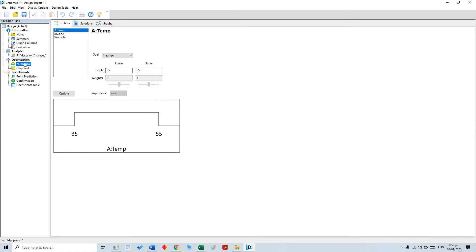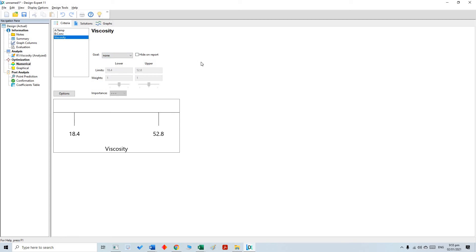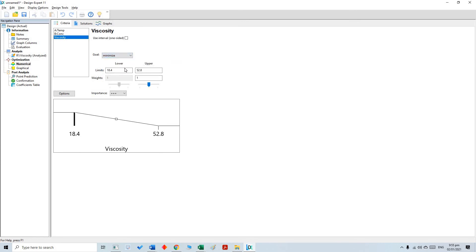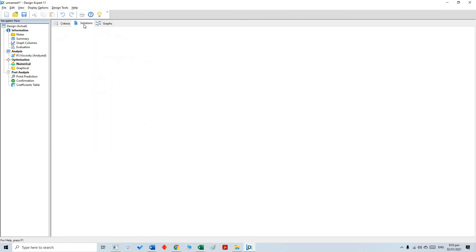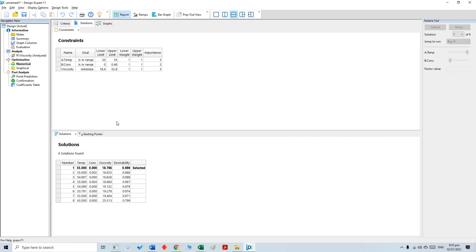We are going to discuss numerical optimization. Our input parameters — temperature and concentration — will be kept within range. Our first target is to minimize the viscosity, so for viscosity we select the minimize option. Once our criteria and goal are selected, we can go for the solution.